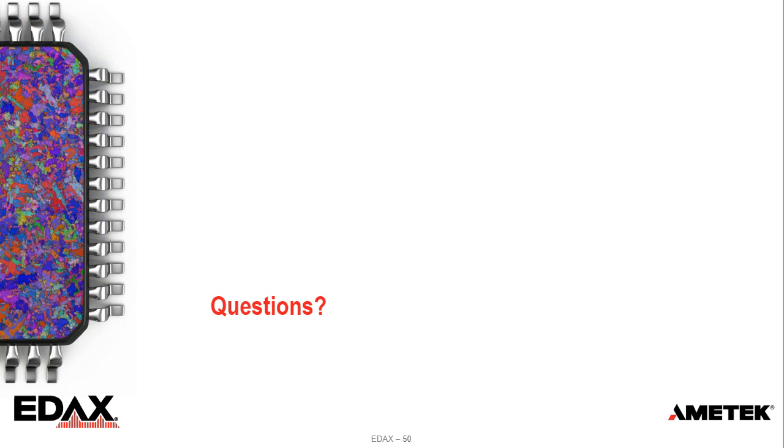So we couldn't measure the sample very well because it was changing over time. But of course, if you investigate, for example, formamidinium cesium, then I would expect higher stability for sure, because normally when you introduce an inorganic cation, you also have, in general, a more stable perovskite.